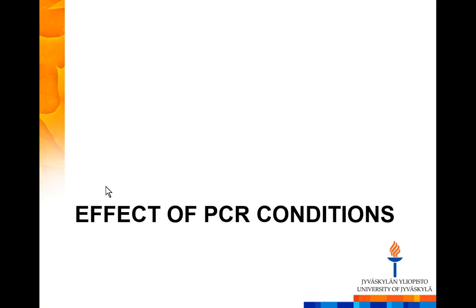So if you expect better separation power, you should definitely also expect more separation power due to unwanted things. Even though what I show here is results mostly from community fingerprinting, you could very well expect that differences would be exaggerated or enhanced by doing the same analysis based on sequencing.